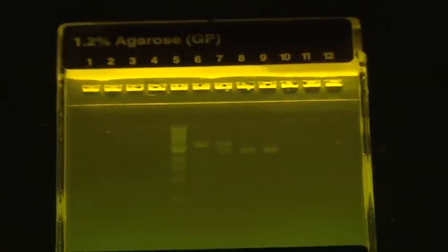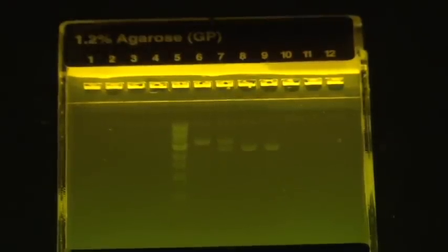Lane 5 is not a sample from a person. Remember, that's ladder that we bought from a company. So you see a series of bands of DNA. Each one is a different size, and we know the sizes of those DNA. So that's our standard. Lanes 6, 7, 8, and 9 contain the DNA from 4 different samples. For instance, in lane 9, you can see that there's a single band, whereas in lane 7, there are multiple bands.